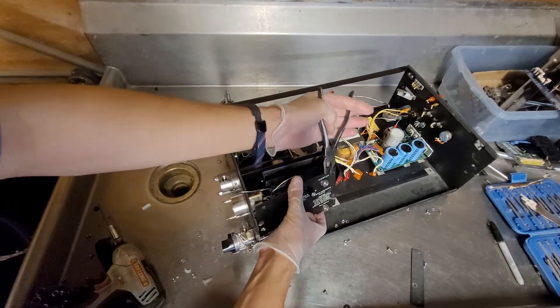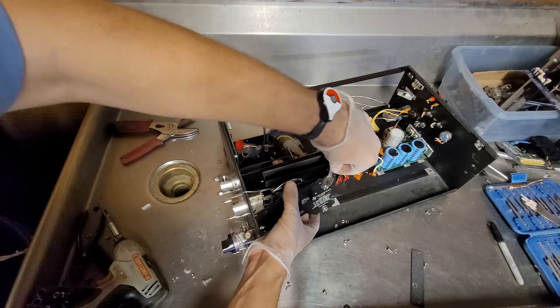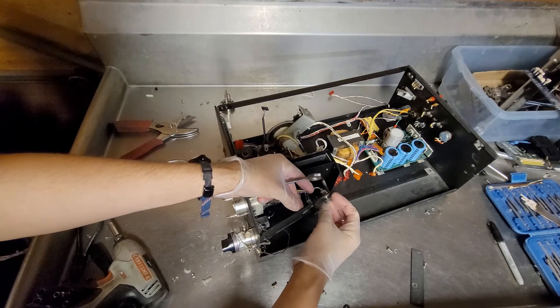Oh boy — if I lose a finger or die from touching it, you'll get a video. Well, not if I die. But yeah, hopefully it's nothing serious.